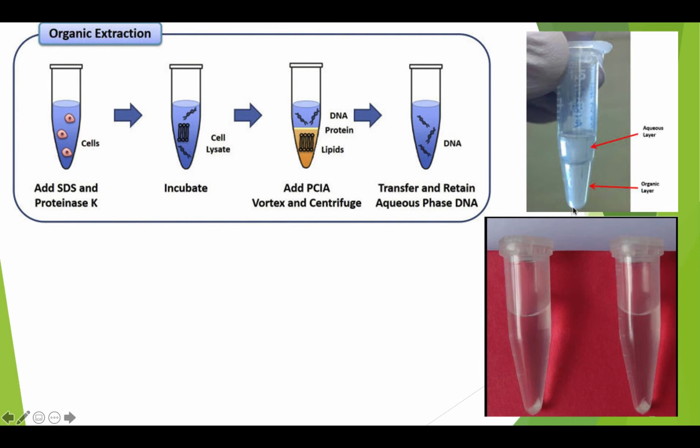For example, in prokaryotes there are small differences from here. There's a kit we used once. It will clump all the proteins down, and you just pull the protein out, and then you will have the DNA fresh. So there are small variations, but basically that's what we're looking at.